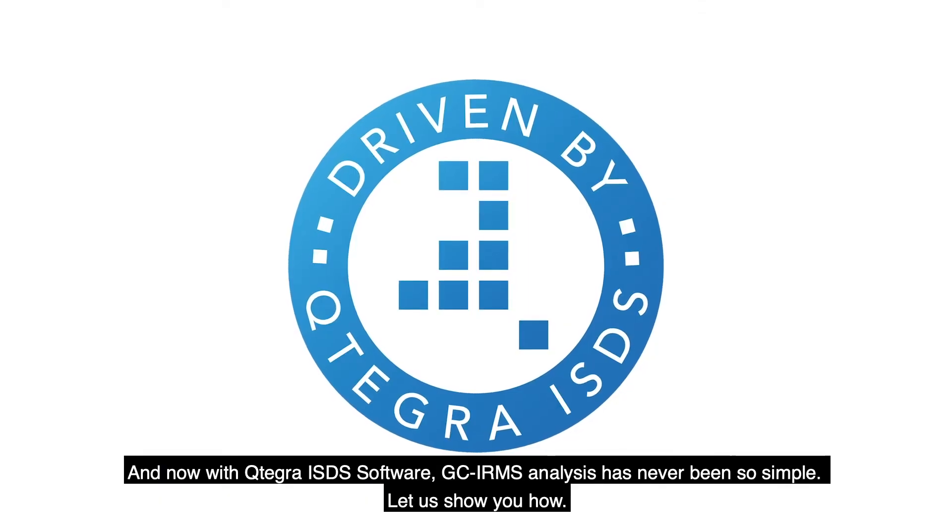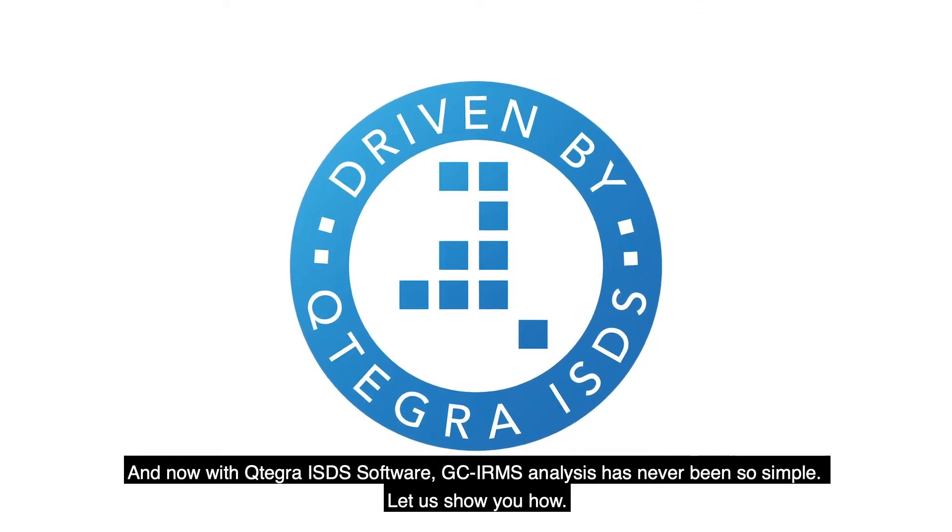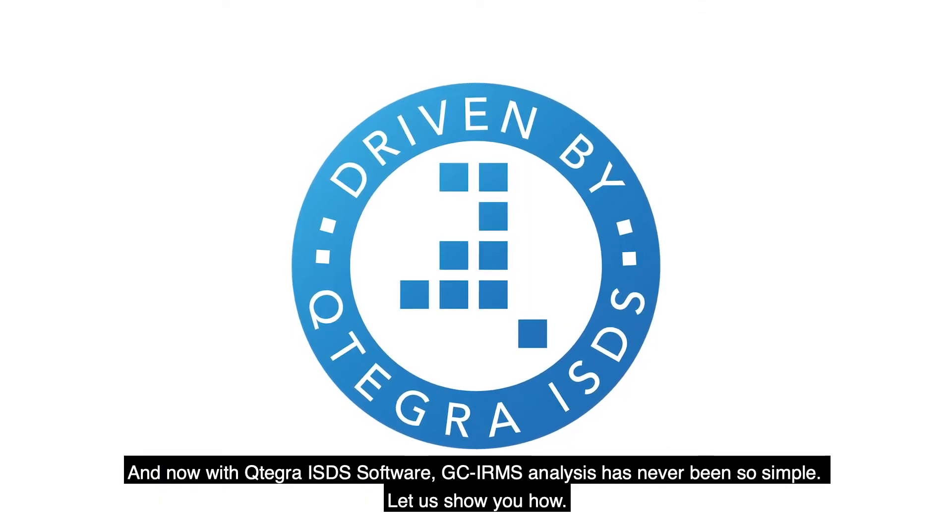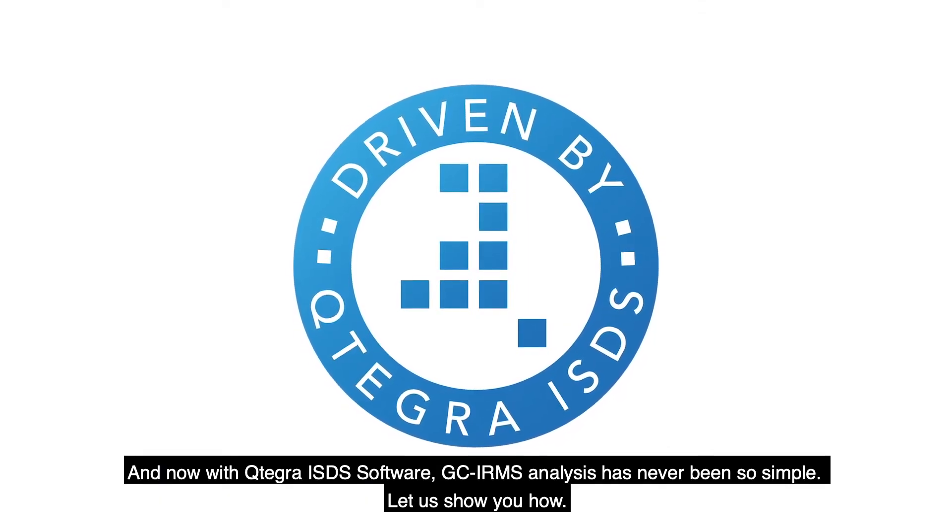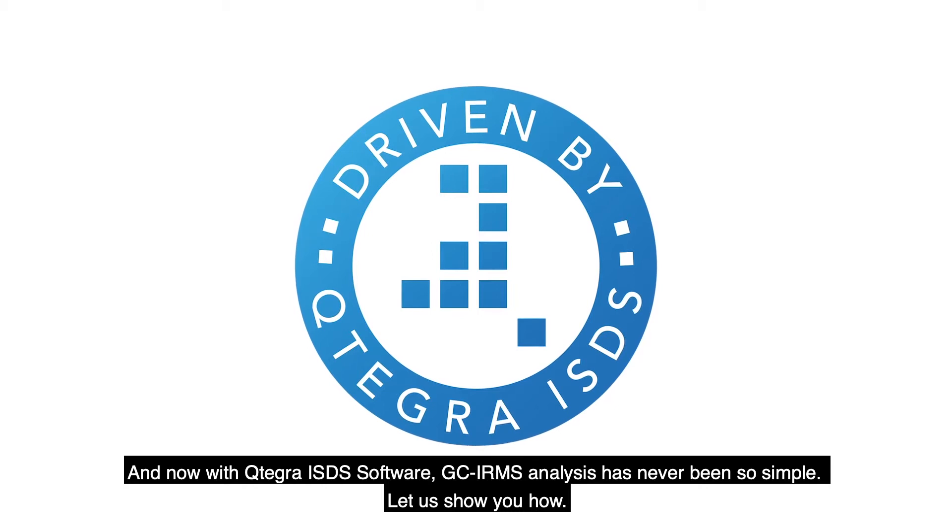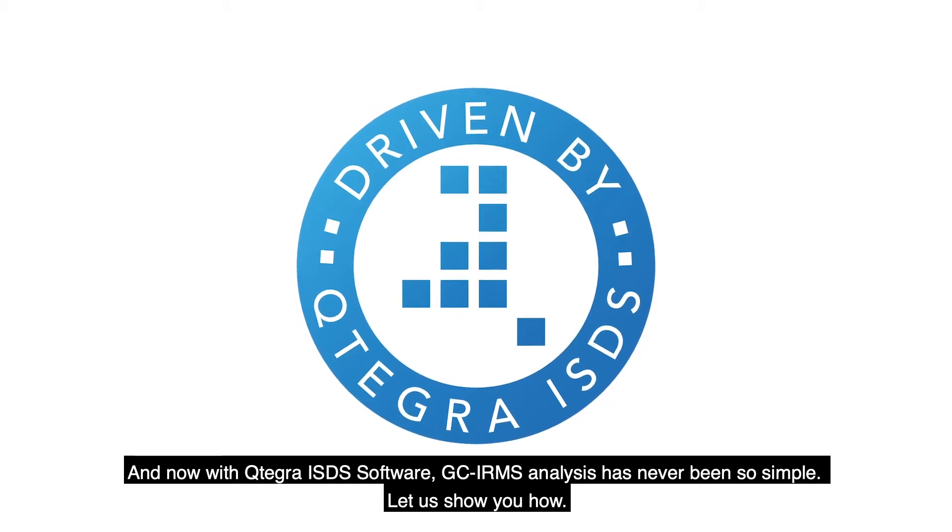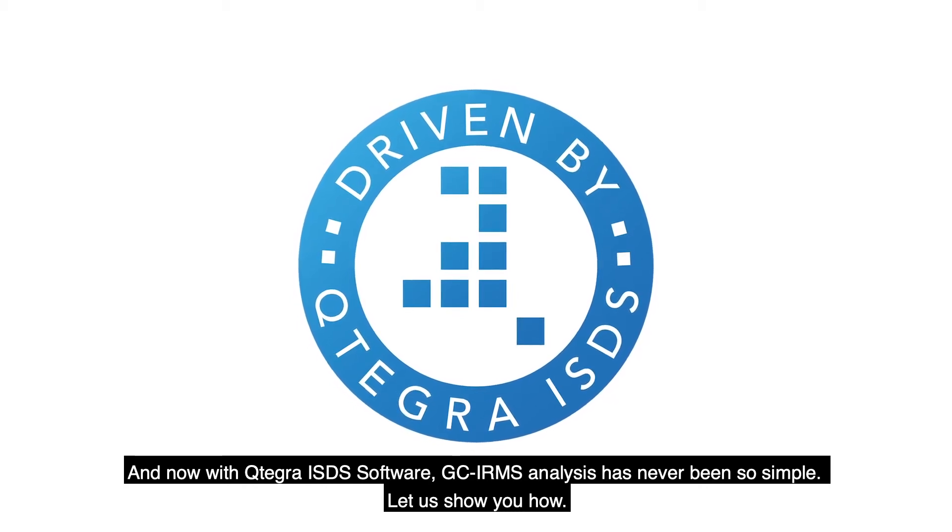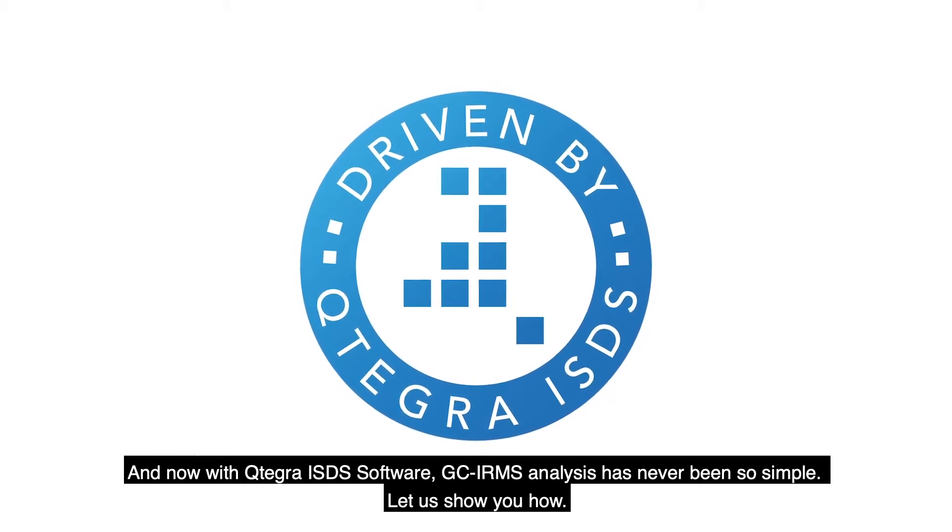And now with Qtegra ISDS Software, GC-IRMS analysis has never been so simple. Let us show you how.